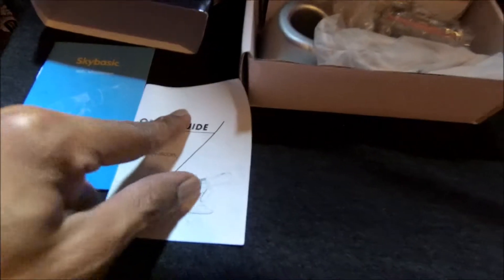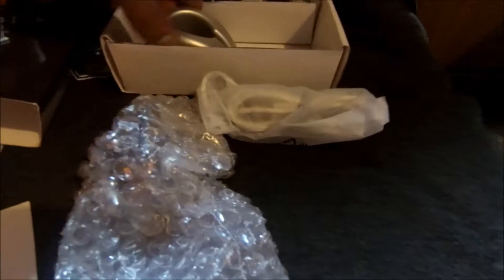You get the instruction manual, you get the base, you get the little USB charging cable, you get the little mic — I mean the microscope — so there you go, my peeps.